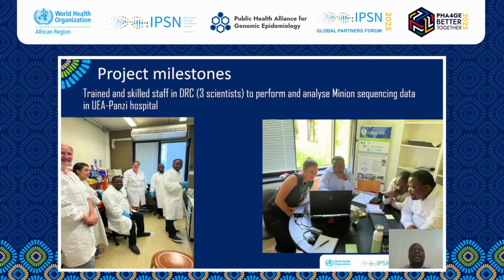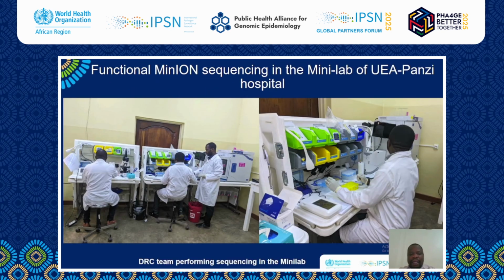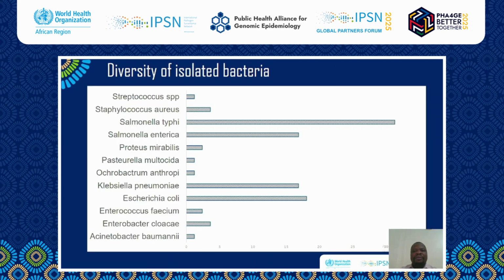sequencing data. As you can see on the photo here, on the left is our training in Brussels at ULB with our partners, as well as the right photo indicating the initiation of bioinformatic analysis. We have also been able to install and run the MinION-sequencer in the Panzi Hospital mini lab. As you can see, the trained scientists are performing sequencing in the mini lab.